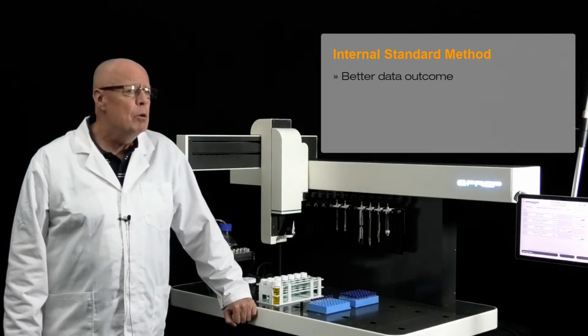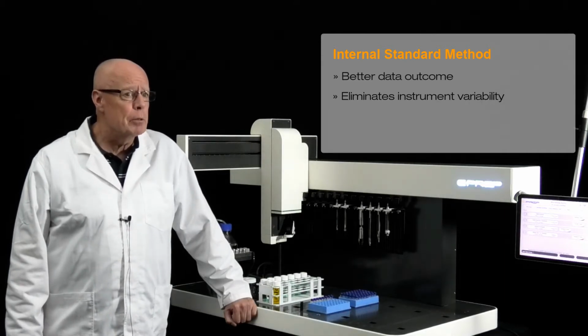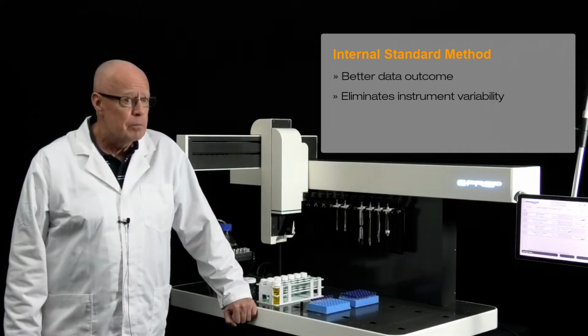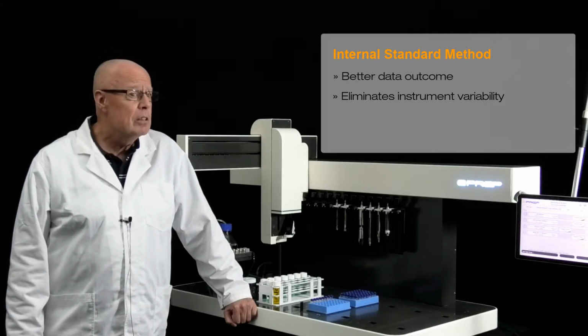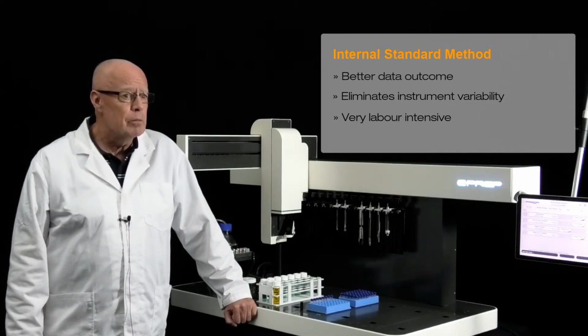I think there's been a move away from this technique in the past few years, and I know the precision of the injection by the autosamplers has gotten a lot better, but typically that does worsen as the injection volume decreases. I think one of the major reasons labs don't tend to use internal standard methods anymore is that they are very labour intensive. So if you have 50 samples, each sample has to be prepped with internal standard addition.